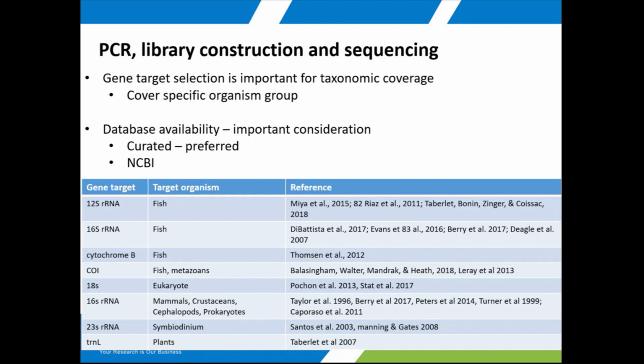For example, for insects you have the COI database, which is quite a good, well-established database. And for fish, I think you have a few databases. Sorry, something has slipped from my mind. But there are a few databases for fish COI, and these are quite curated and specific COI databases created for the specific target organism.